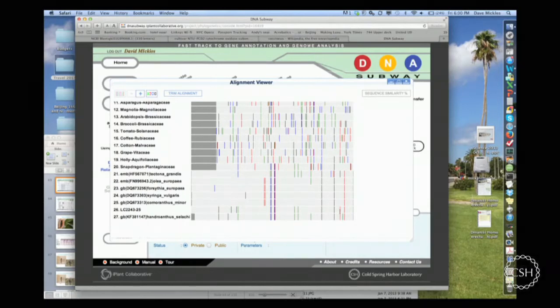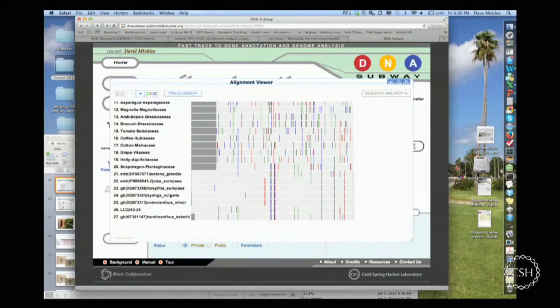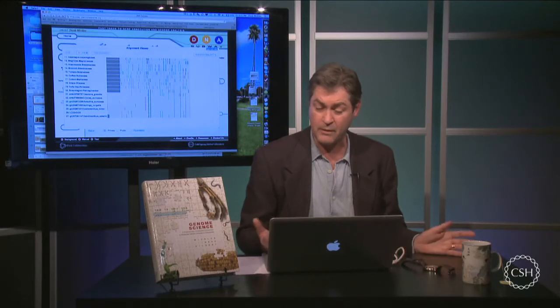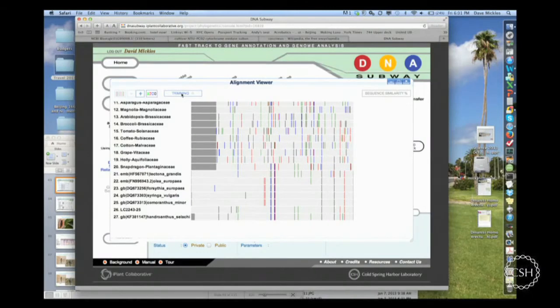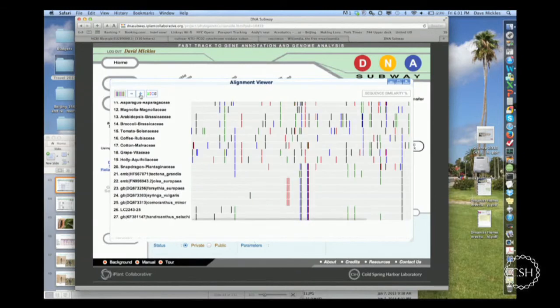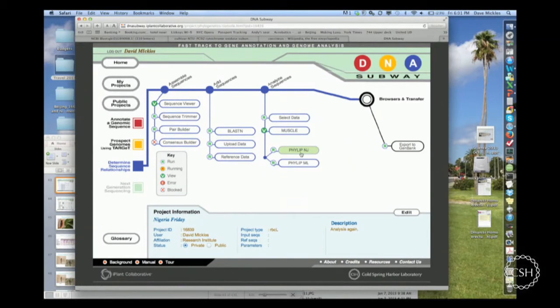So the point that I'm showing you here is that last time I got a very, very close match, just one nucleotide difference between my sample, the Akparata, and the Ephelia. In this case, I'm off by a bit more. And if I trim this alignment, I can also quickly build a tree. And there's the trimmed sequence. Again, you can zoom in as much as you like and scroll through it to see the differences between the samples. I'll build a quick tree.